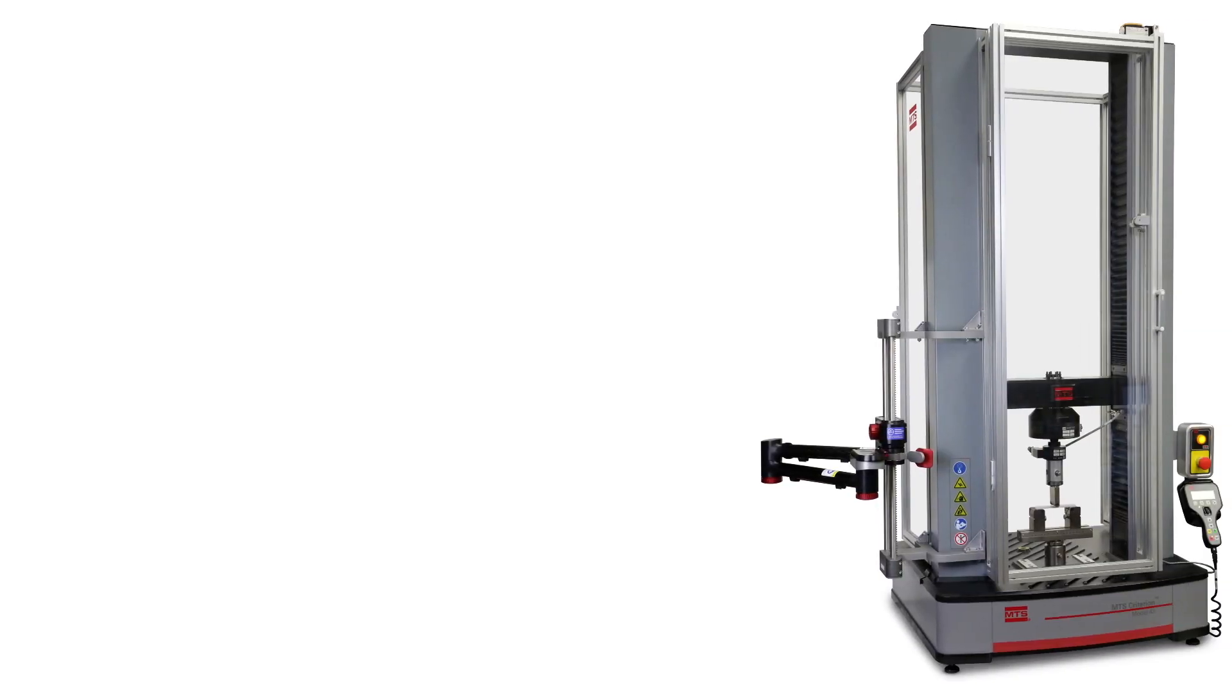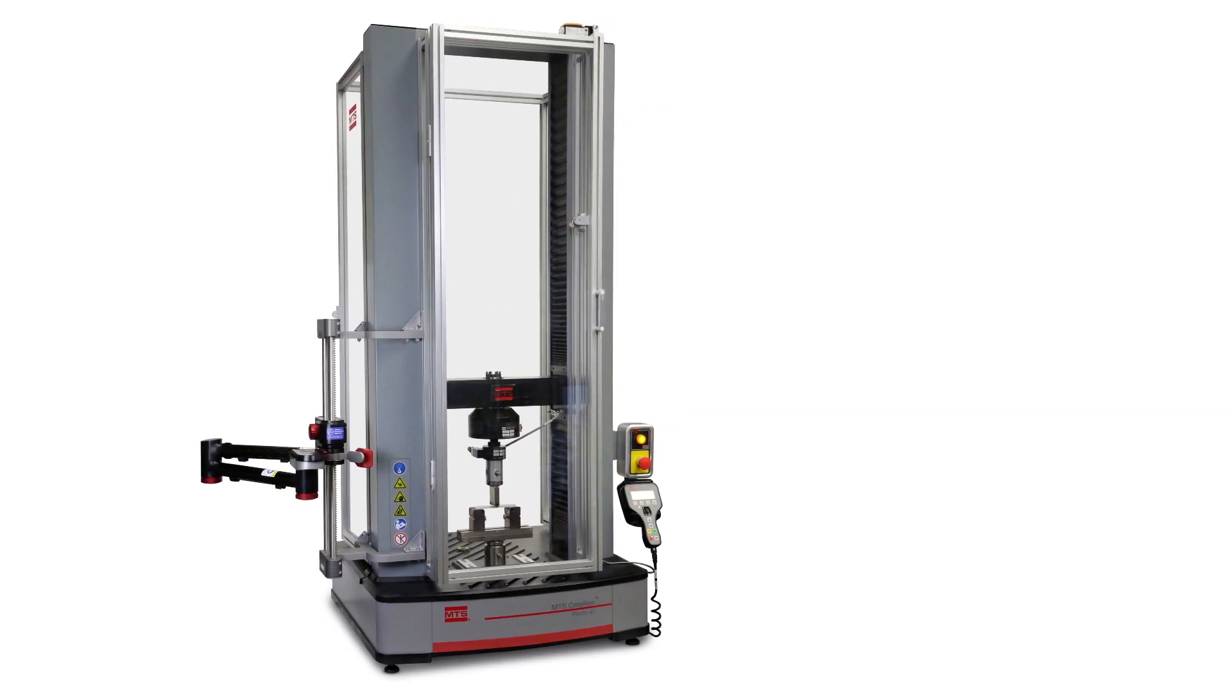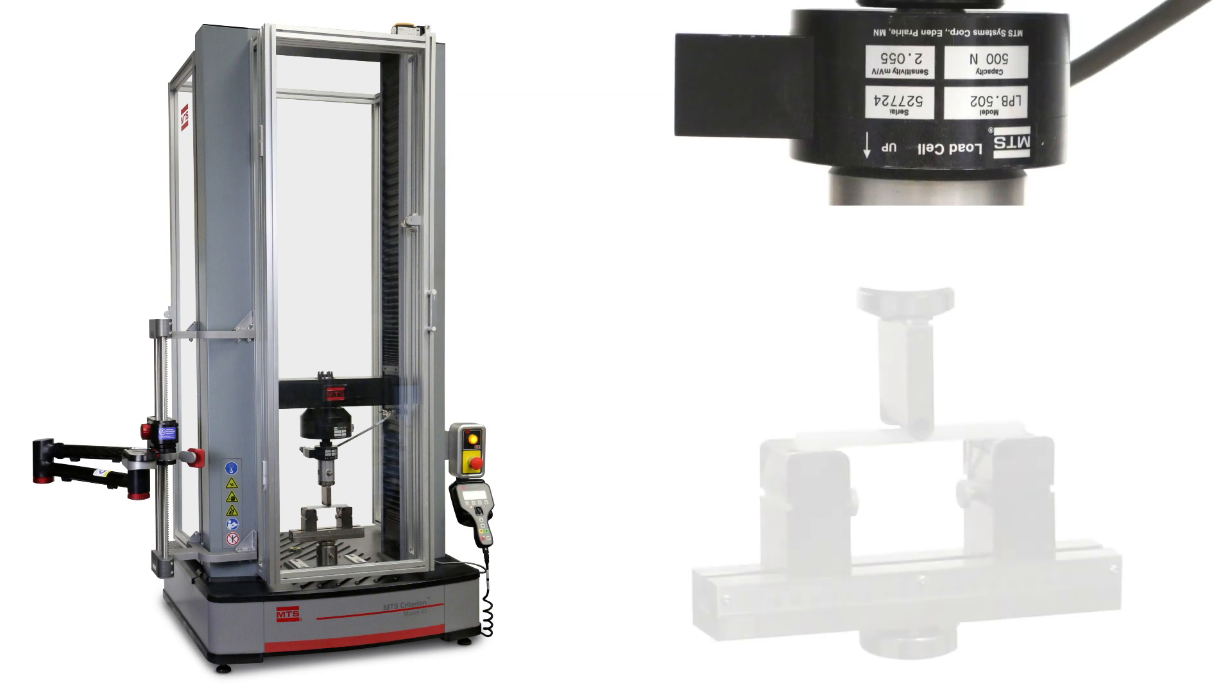For this test we will be using three main pieces of equipment: a load frame, a load cell and a bend fixture.